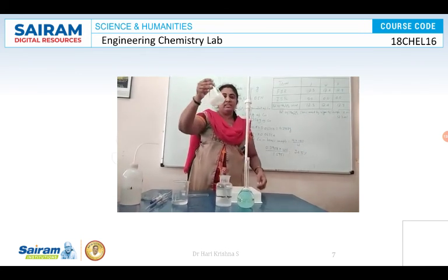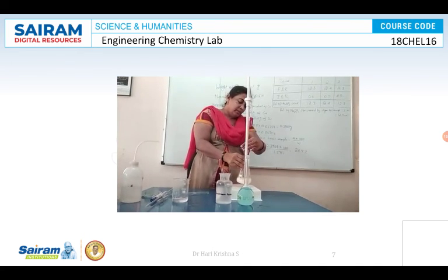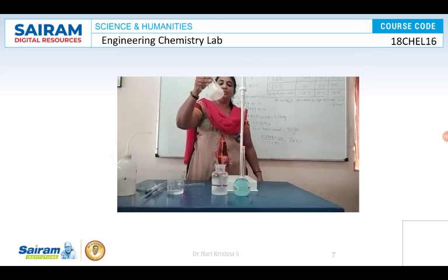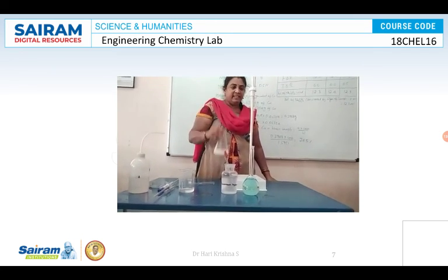If any unreacted iodine is there, you may get the color back once again. So just add few drops. You will be getting clear white precipitation. This is the end point. We are getting white precipitation because of the formation of cuprous iodide. This is about the titration.